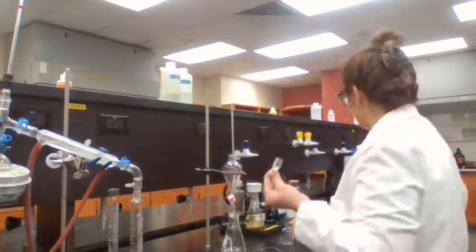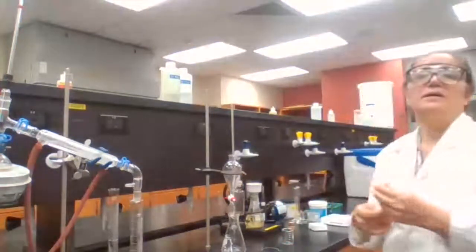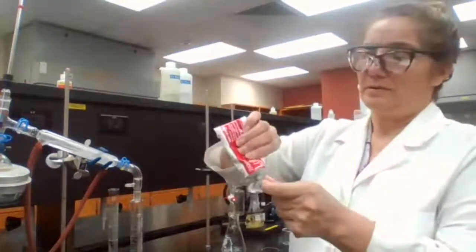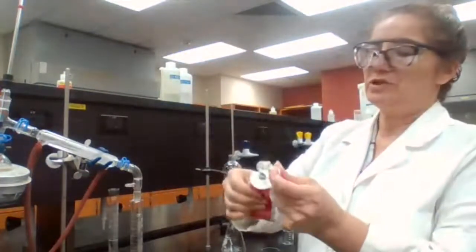The glass stopper must be very good. So I'm going to just prepare this.